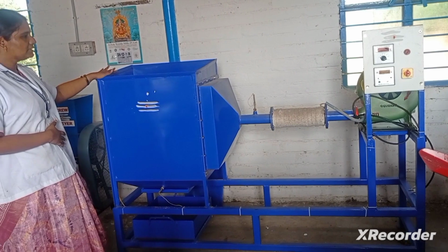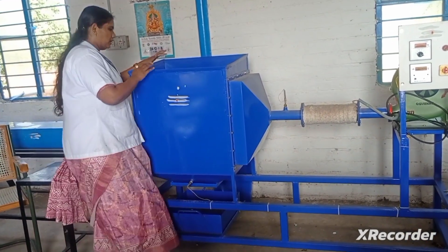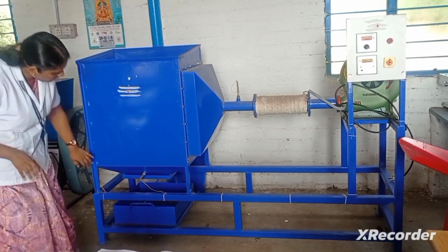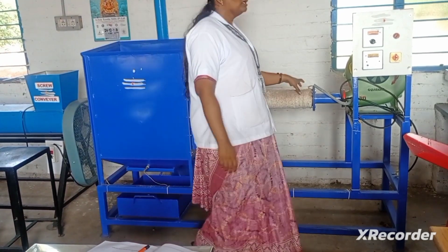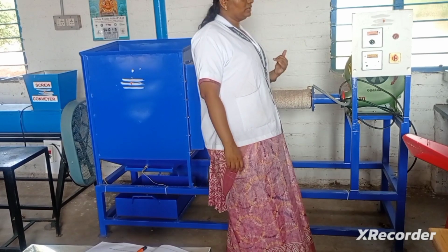First, we have to place the given sample in the chamber. We have to pour the given sample into the chamber, and we have to close it here. Then we have to start. We have to set the temperature of the air blown for the particular sample.